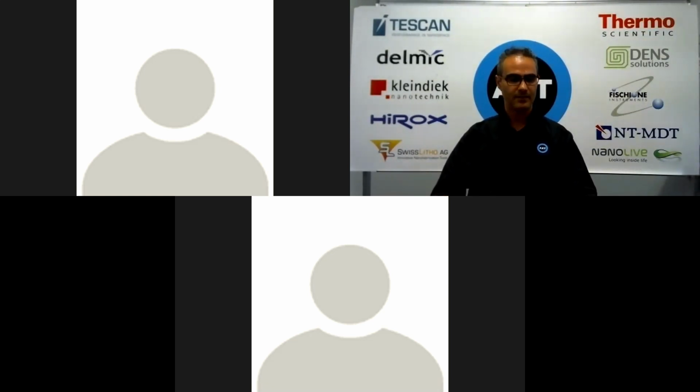And again, in addition to what Will said, when you have a plasma FIB, you can easily change the gas from xenon to other gases that can generate plasma. So oxygen would definitely help a lot because it's less invasive than gallium and xenon. And also, as mentioned, argon would maybe be the best choice for that sort of application. And you can easily shift from xenon to argon. So I hope that answered the question.